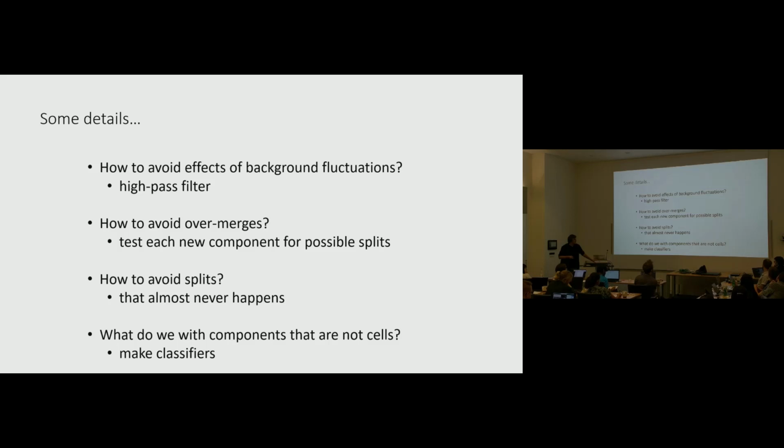How are you going to deal with the overmerges though? Well, first we're going to try in the main code to see if we can do better tests for whether something is overmerged the very first time we collect that ROI. So you don't want to do it in the GUI at all? Sorry, I think we could consider that. If that doesn't work, then maybe in the GUI there can be a little program that runs and gives you a new, more oversplit view of the same data set.